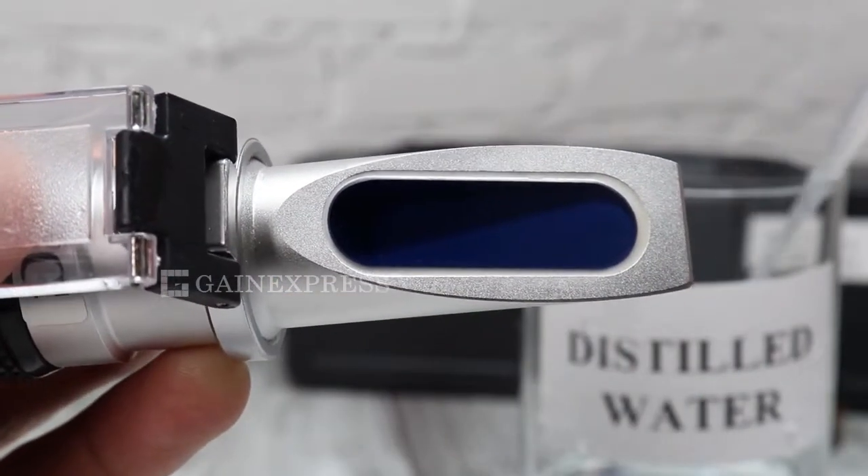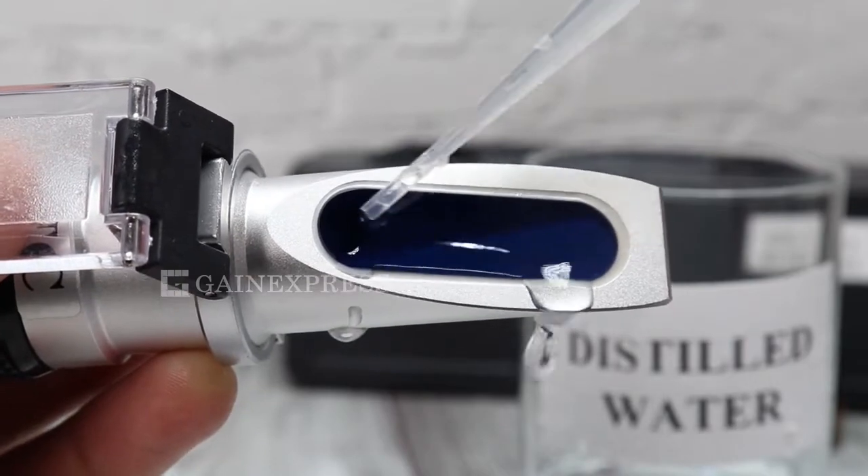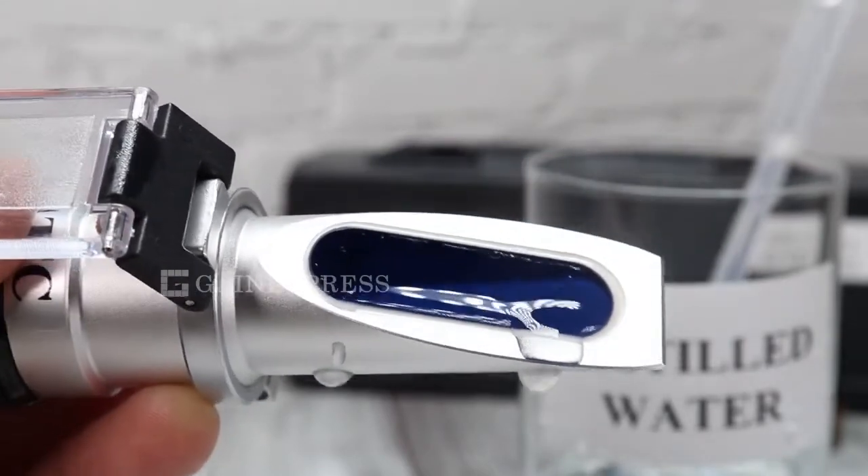Always clean the instrument between each measurement using distilled water, and dry it with a soft damp cloth.